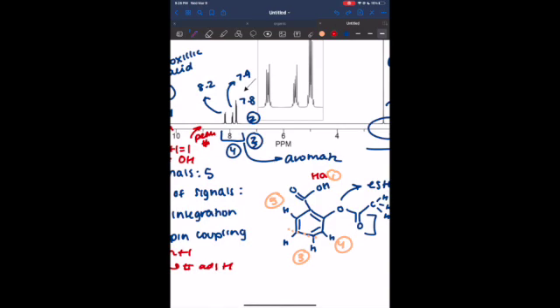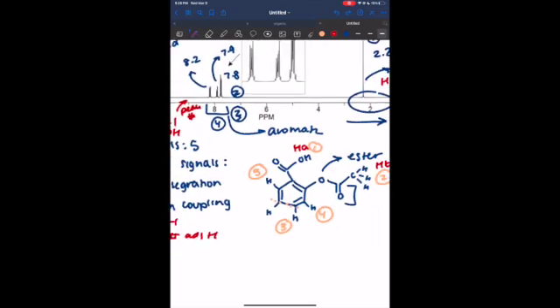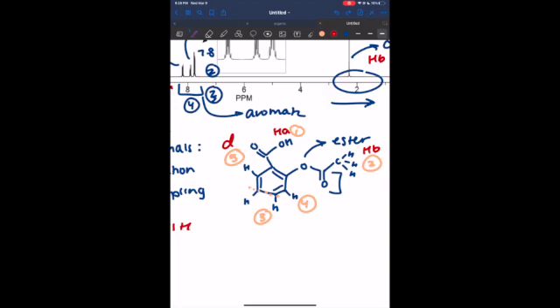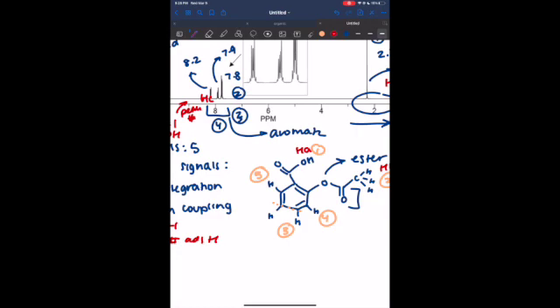Knowing upfield and downfield shifting: downfield shifting occurs with a decrease of shielding, so an atom next to a more electronegative group will have decreased shielding due to that electronegative group stealing those electrons. So in this, I would most likely say that 5 would be more of the downfield. It's next to that carboxylic acid group, which is much stronger than the ester, and so I would put that one at HC, that most downfield shifted group.